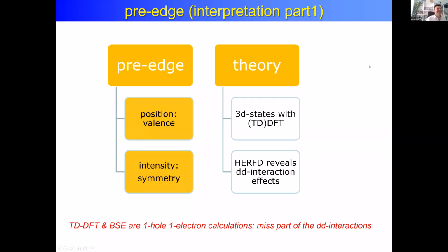Yeah, that's a good question. Maybe some other people in the audience are more expert on that than me, but I know that often there's the traditional arctan subtraction. Here we go. So they usually use an arctan. Yeah, I would say if you do the same subtraction in every spectrum, then you make the same approximation, so at least you have a consistent result.